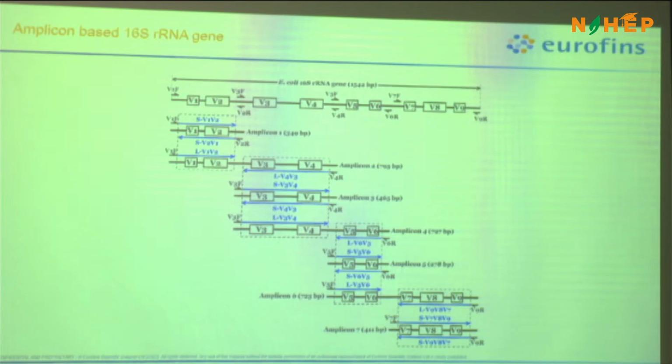So we can use nanopore because PacBio is on the expensive side and nanopore is on the lesser side, and nanopore is good for this type of amplicon sequencing when you want a huge resolution and want to know in depth what your rare ones are, what your abundant top ones are. Then long read is very nice.